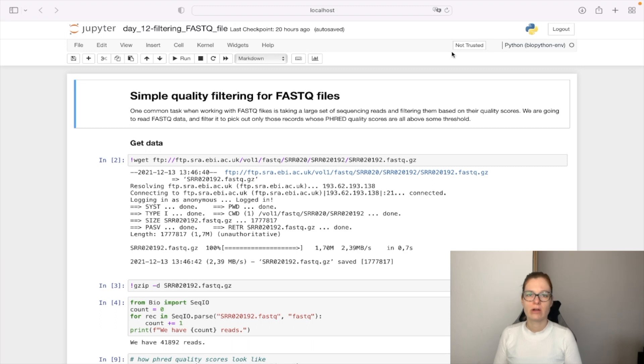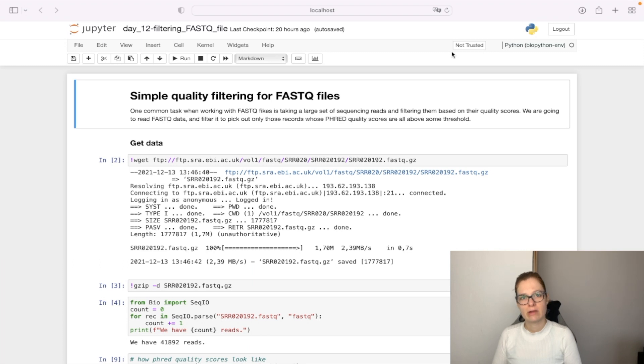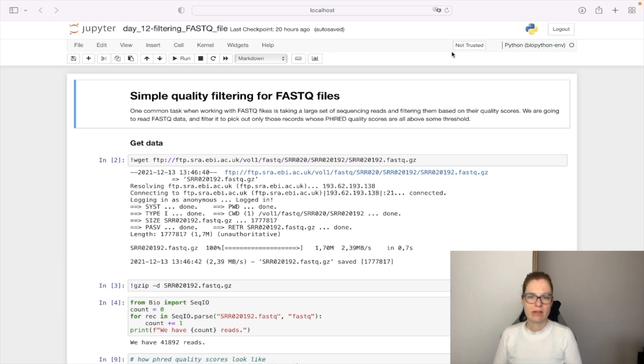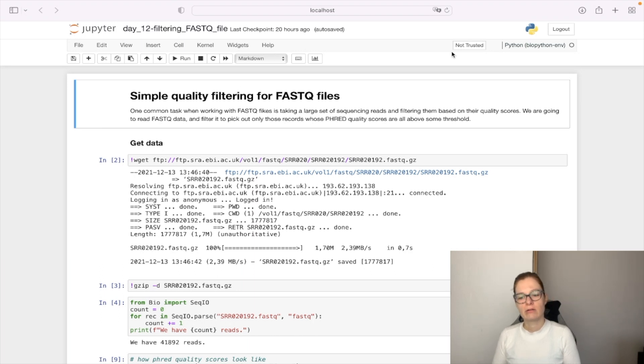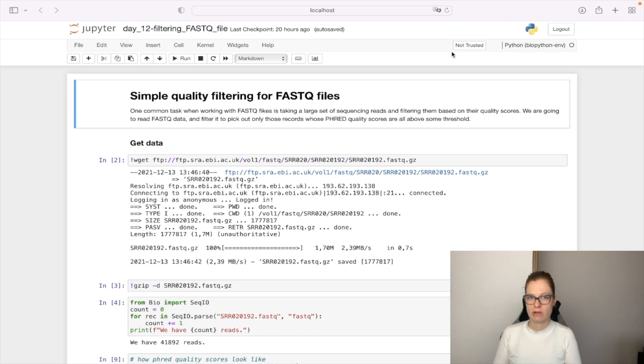One common task when working with FASTQ files is to take a large set of sequence reads and filter them based on their quality scores. Here we are going to read the FASTQ data and filter it to pick only those records whose Phred quality score is above some threshold.